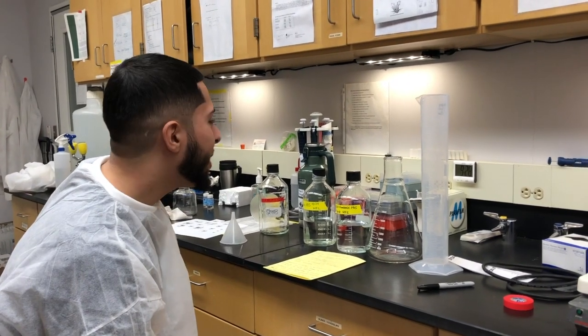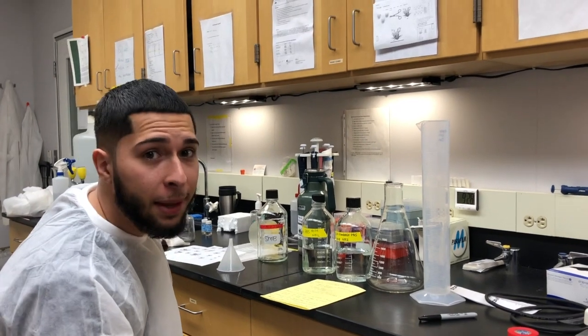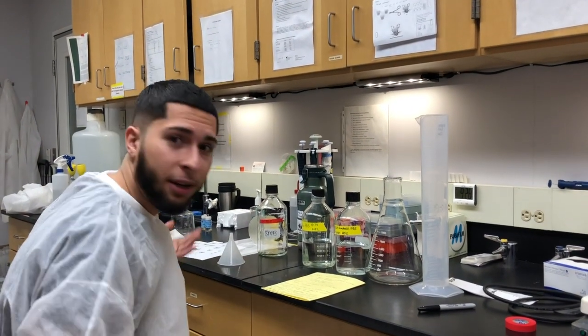Hello Beerbauer Lab. Today we're going to learn how to make 0.1 molar PBS. We're going to be making one liter of that and my job is to show you the step-by-step process and how we're going to accomplish that.